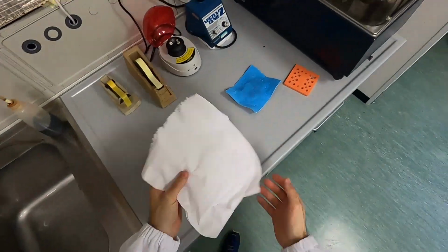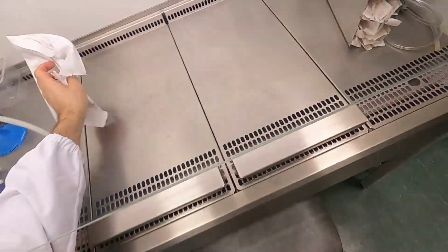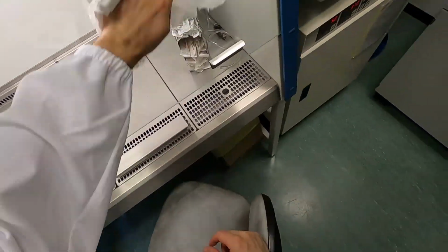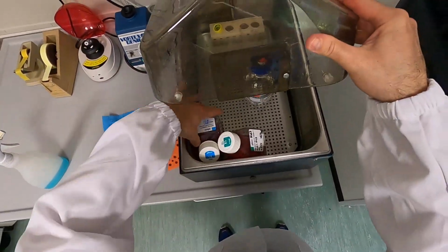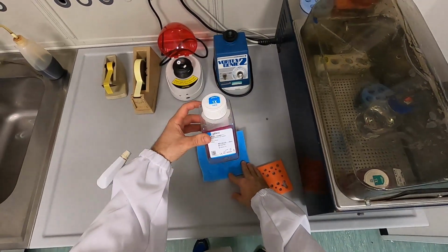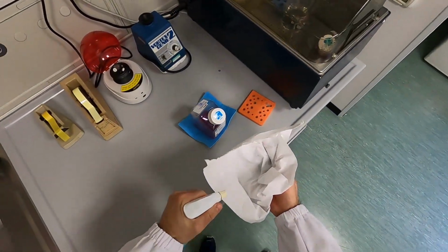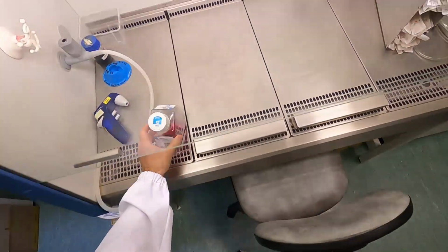Let's clean the flow cabinet. Take our medium out of the water bath. This time we don't need the trypsin, we don't need PBS, we just need plain medium. And then we need, of course, a lot of tubes. So a tube rack is very handy.